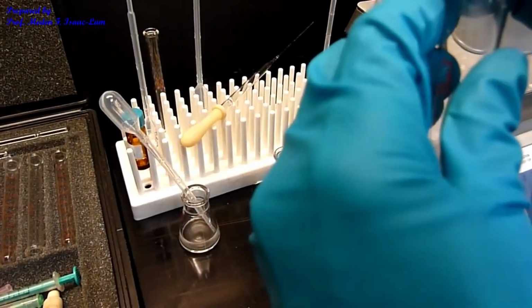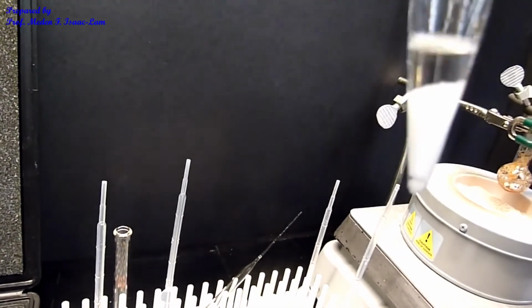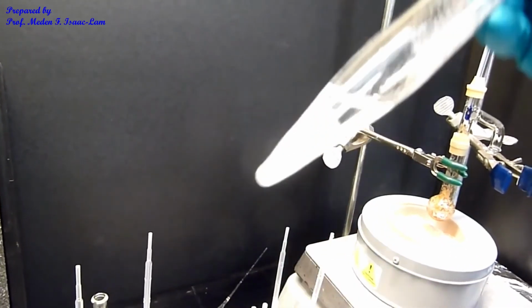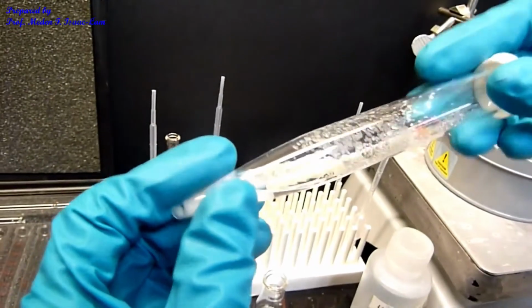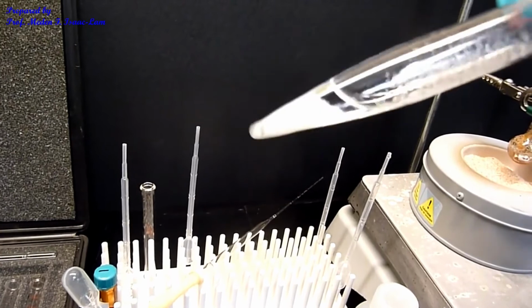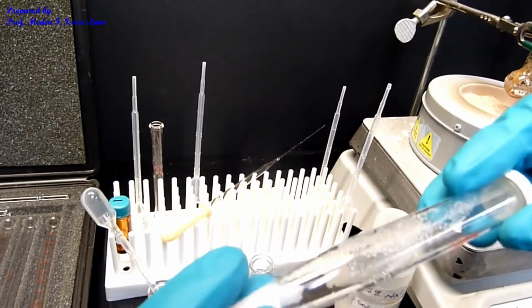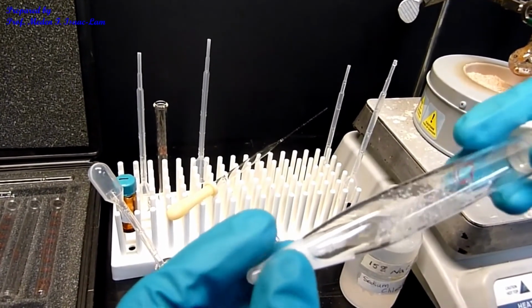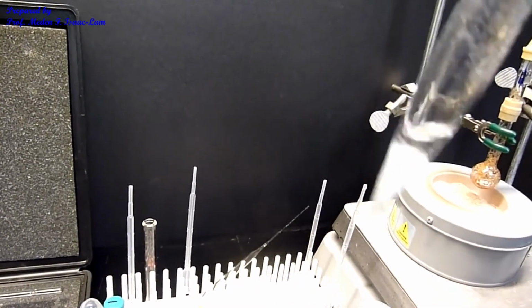And then I'll cap it. Right now it's clear. So the water is at the bottom actually, as it got absorbed. And then we're just going to let it sit, and we're going to put the liquid into that tared vial, and then we'll weigh it, and then we're going to run the IR. So I'm just letting it soak so that we don't have any water. So right now it's clear, and let it sit for a minute.